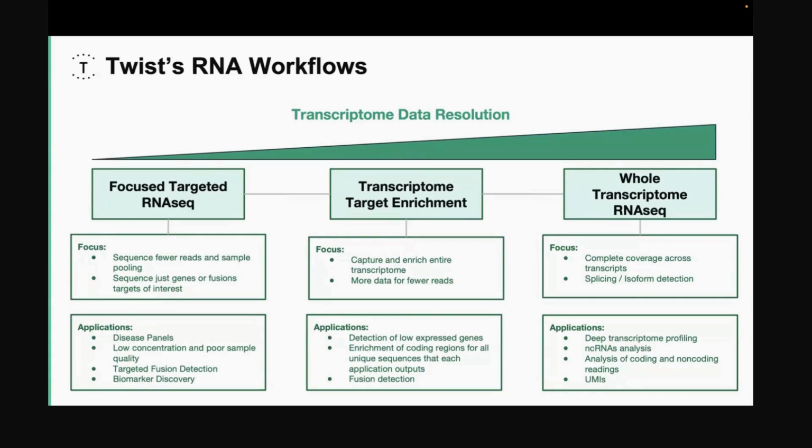Along with that, you don't need a lot of sequencing reads, but you get more data with fewer reads. Here, the applications can be detection of low expressed genes and enrichment of coding regions for all unique sequences. Especially in the field of oncology, you can utilize transcriptome target enrichment for fusion detection.